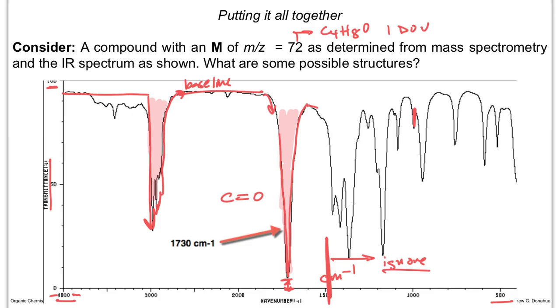So we want to look at these intense signals. What's the shape of them? A lot of these functional groups will have a unique shape. They're not normal-looking shapes like a box or a sphere or anything, but you can sort of tell, if it's got an alcohol, it looks like this, therefore OH is present.